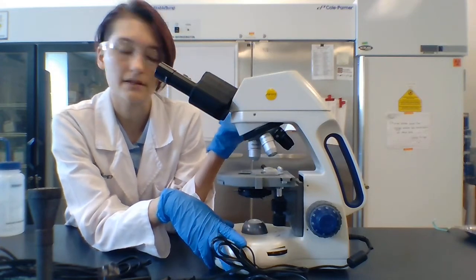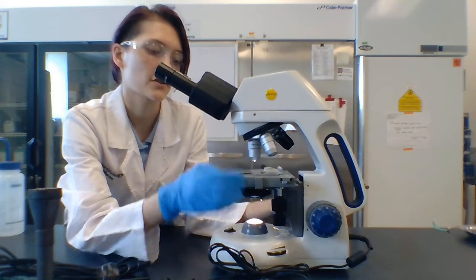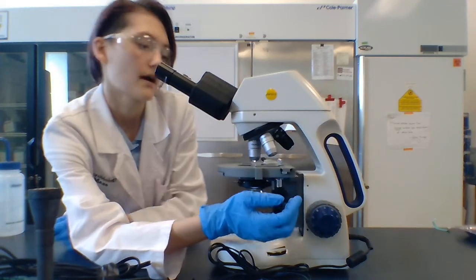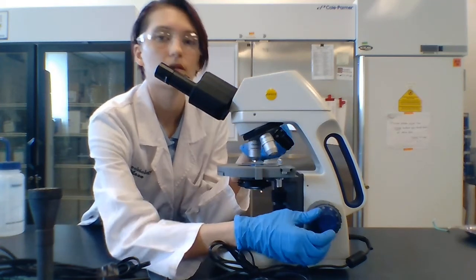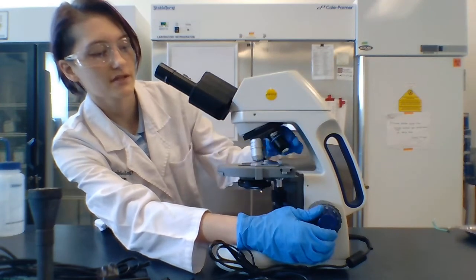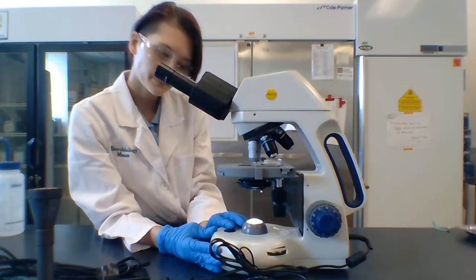So how would we go to look at this? We would turn it on, and we would focus on these objectives. So you want to always start on the lowest power, which is just going to get it so that we can find what we're looking for. And then as you focus at each stage, you would use these focus knobs to get the image to look clear, right? So every time that you have the image focused, you would go up to the next magnification. It goes all the way up to 1,000 times magnification.